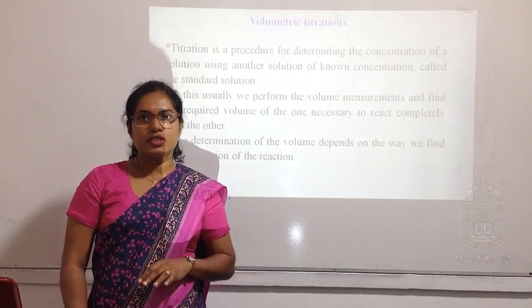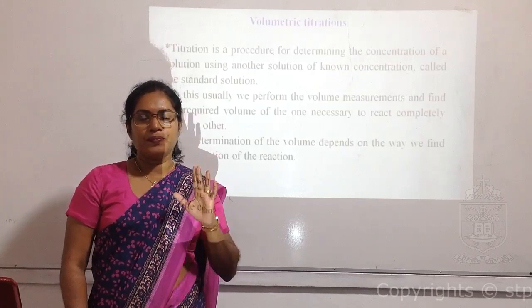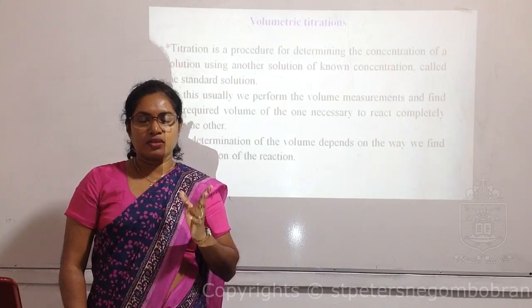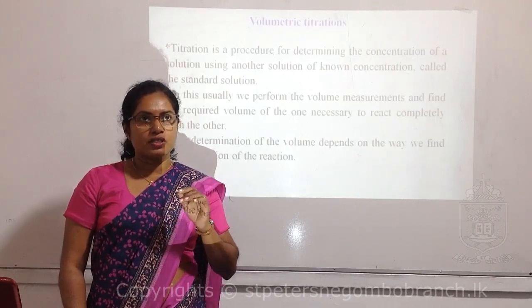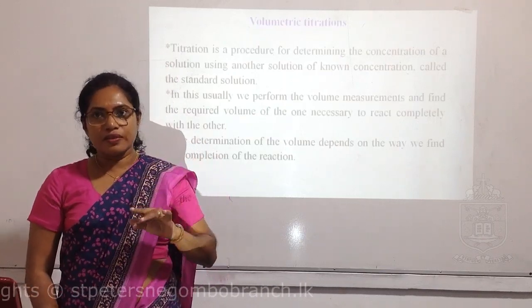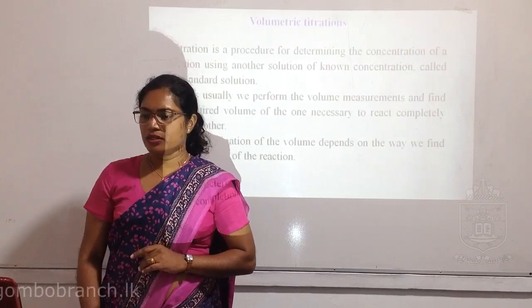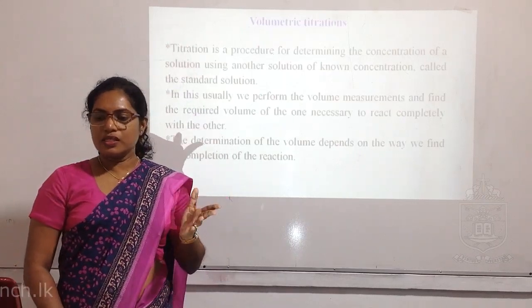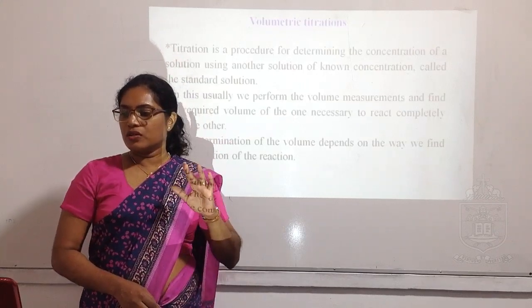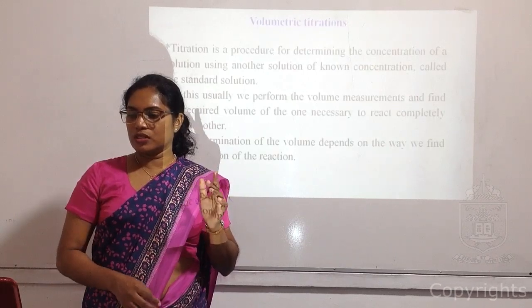Normally we do volumetric titrations to determine the concentration of a solution by using another solution of known concentration. And in this, usually we measure the volumes of the solutions.